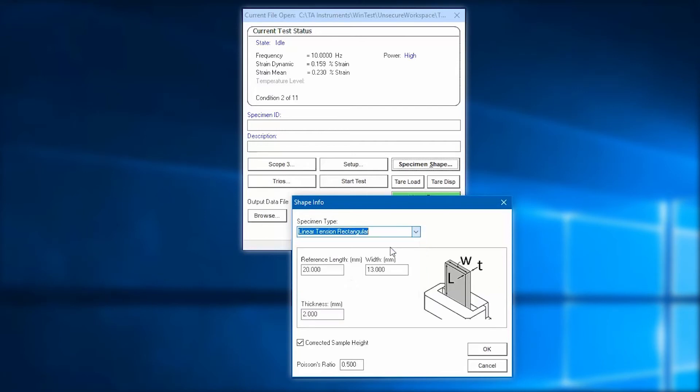For this test, I select linear tension rectangular. I type in the width and thickness that I measured previously.